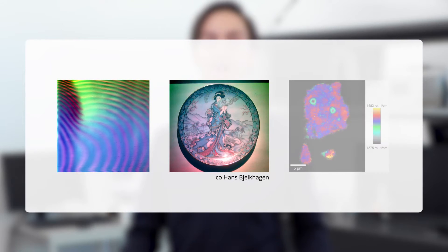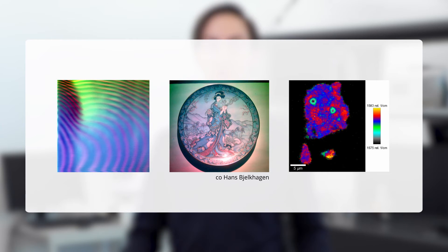These high performance series of lasers are typically used for applications where the single frequency nature of the laser is required, such as interferometry, including holography and high resolution or low frequency Raman spectroscopy.